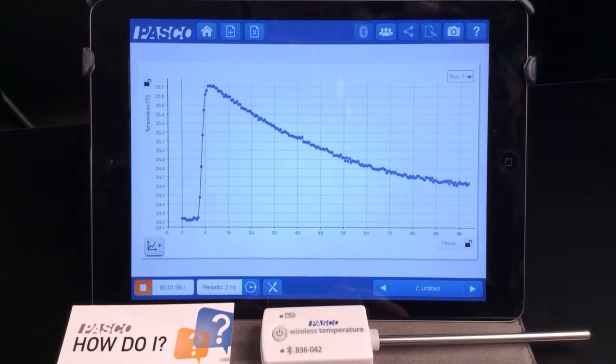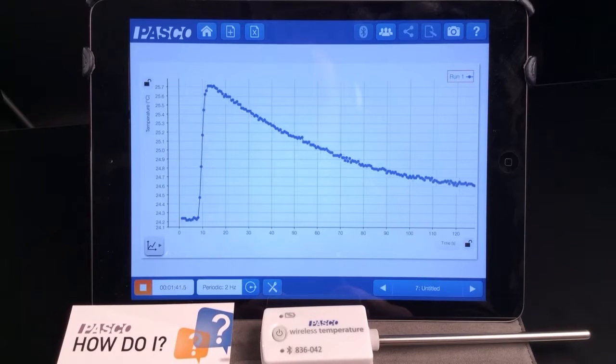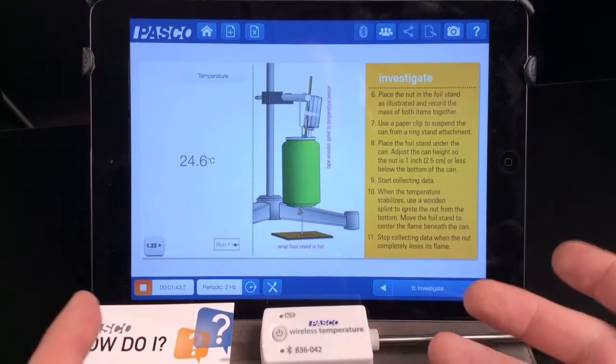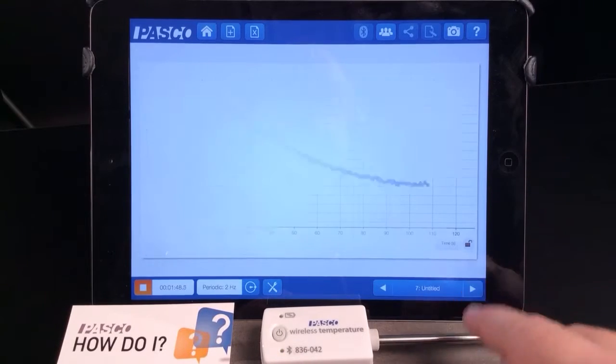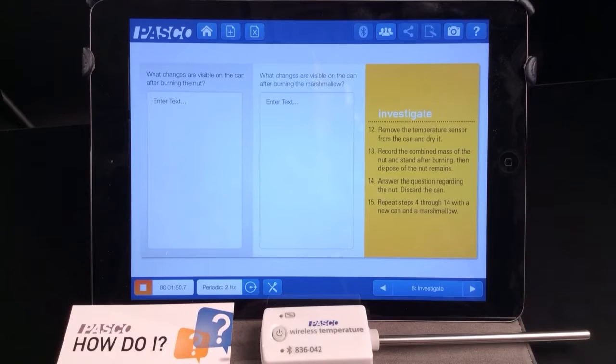And there I can see a plot of the temperature that's being recorded. Notice that as I go between pages, data collection continues, so I've done nothing to interrupt that. The existing content is still on the subsequent pages after the one I've built.